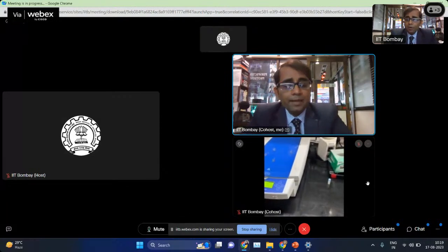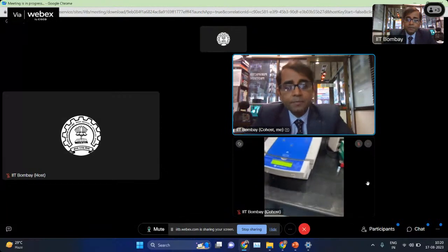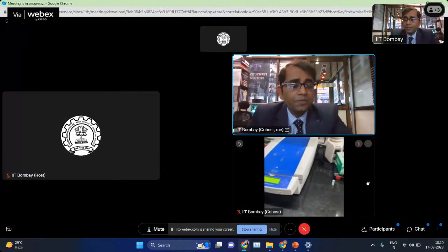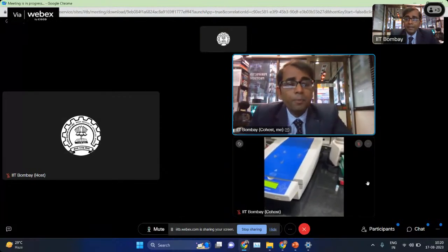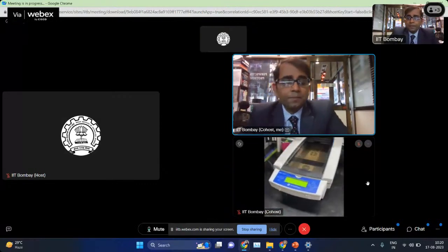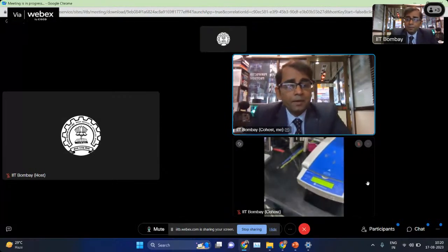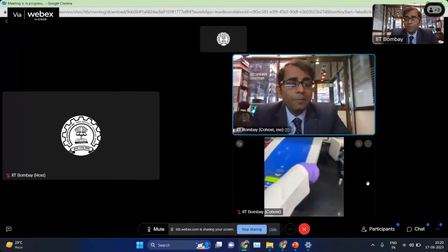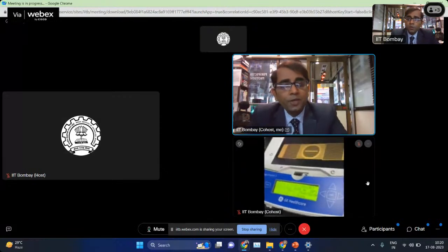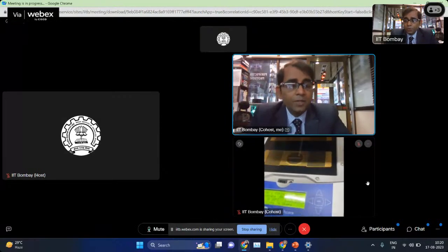So that process can be done as a rehydration strip or the passive rehydration strip, which you will do overnight. And after you have done the rehydration of the IPG strip, then you will place this in the unit, which is what you see here, the isoelectric focusing unit. And it is actually what you see from the transparent thing there. Here from the outside, you can set up the program, you can set up the voltage, and you want to ensure that sufficient voltage hour is being attained when your IEF is going on, right?